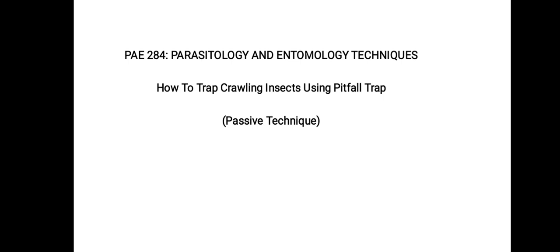And so, when talking about using pitfall traps to collect insects, there is a procedure that must be followed one after another so that the desired results will be achieved at the end of the day. And now, we want to look into the 6 processes that we must follow in order to effectively use pitfall trap.